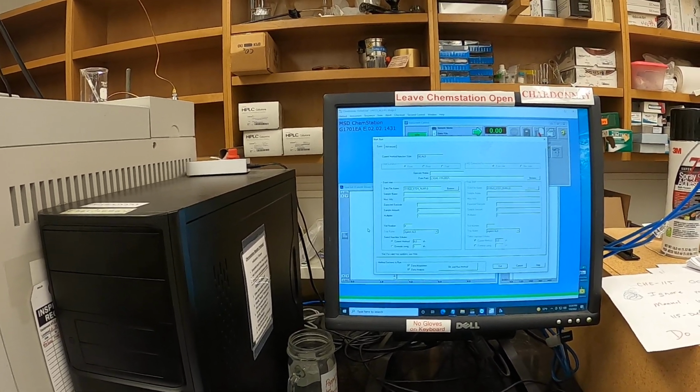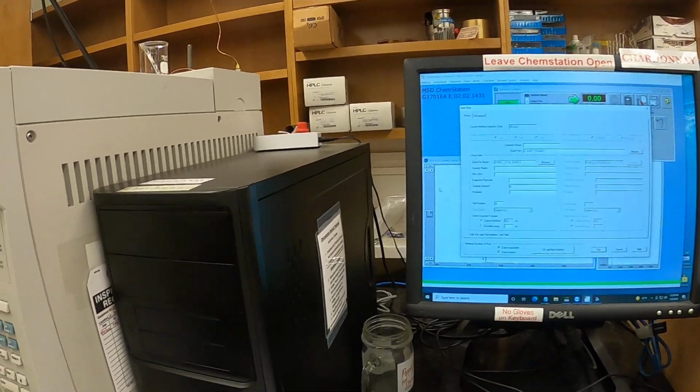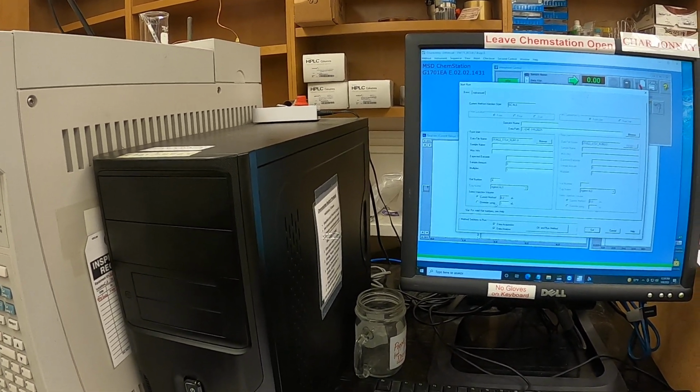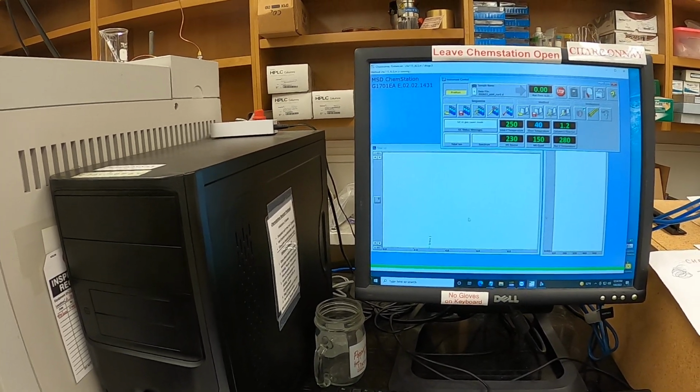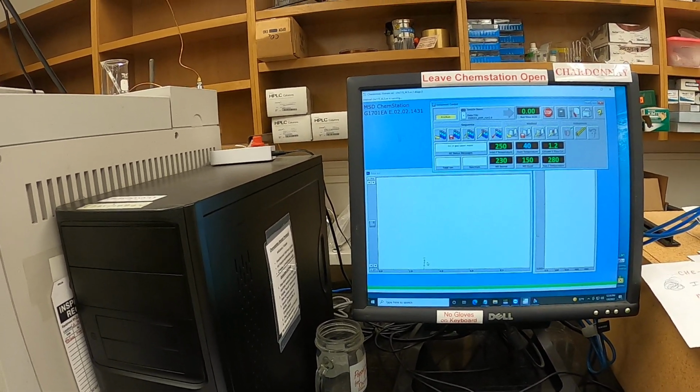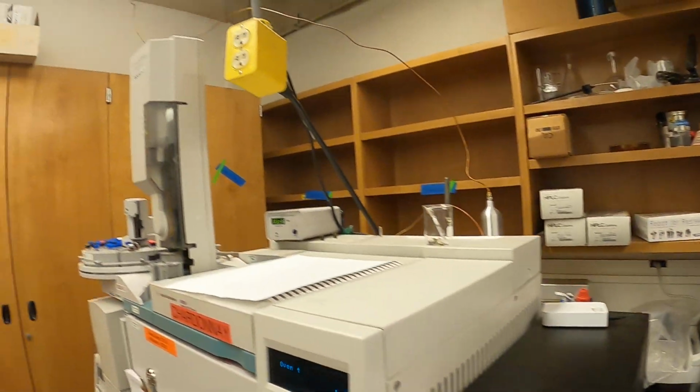And you know, when I did 1, I got 8 million. So I'm going to try the 0.2, and that was using 1 microliter that I got 8 million. So then we're just going to hit OK, run method. You saw the group 1 pop up. That's our first indication everything's going well.